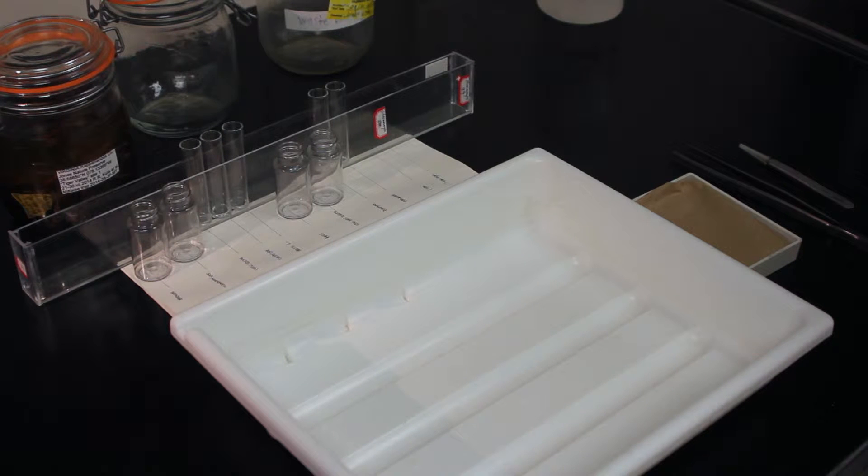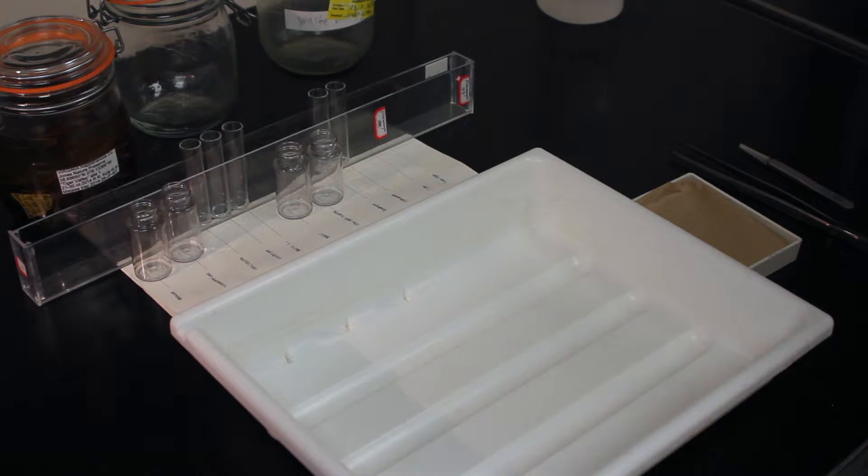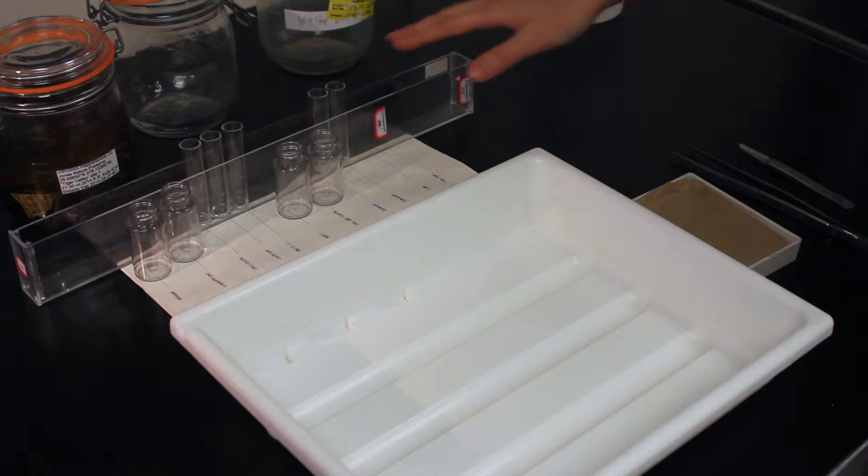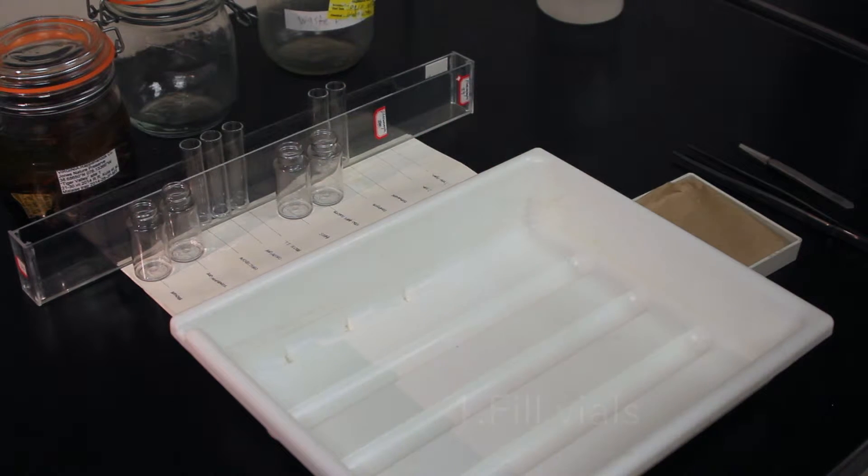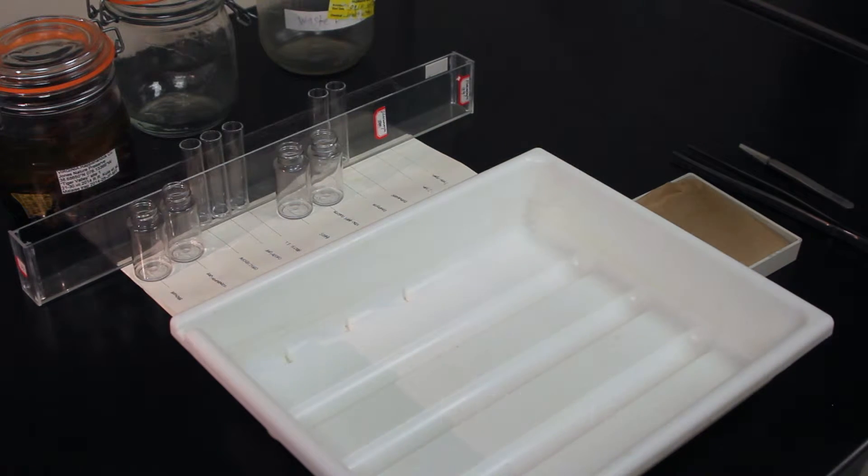To begin sorting our sample, we've set up our vial station according to taxonomic order. Inside the plastic vial rack, we've placed the shell vials and outside we've placed the scintillation vials. First, we're going to need to fill all our vials up with 95% ethanol.